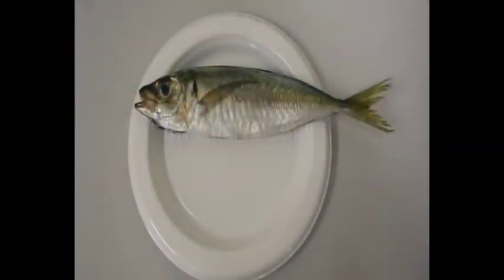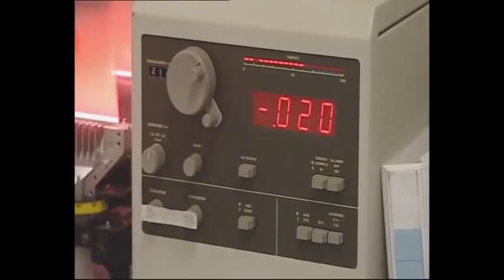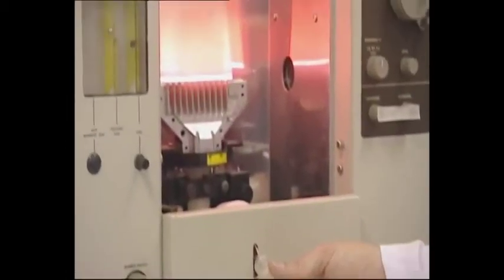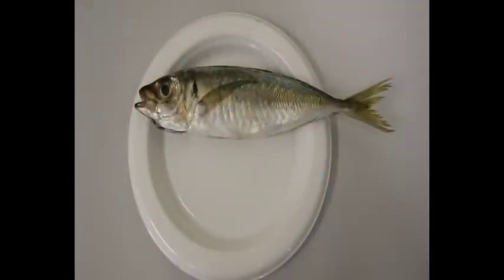What has this fish and world-famous CSIRO scientist Alan Walsh got in common? Well, the answer is both spent their working life in Australia. Walsh went on to receive a knighthood and great scientific notoriety for his work in developing this instrument, the atomic absorption spectrophotometer, which was conceived in a flash of inspiration in a Melbourne vegetable garden on a Sunday morning in March 1952. The fish went on to star in this video and also became the second course at a fish and chip shop in Ultimo on a Sunday night in March 2007.